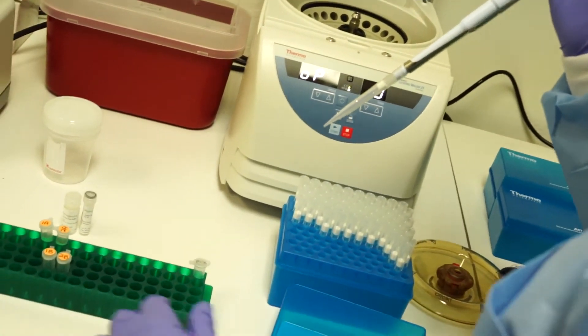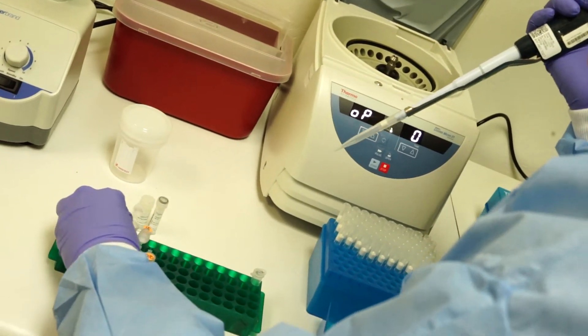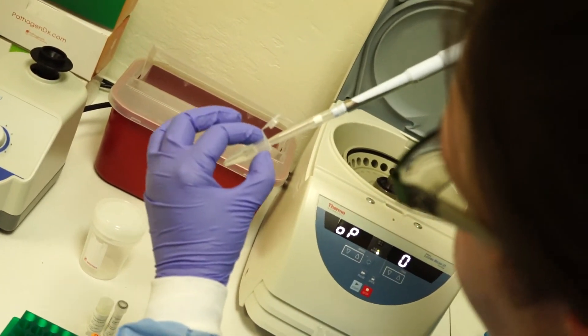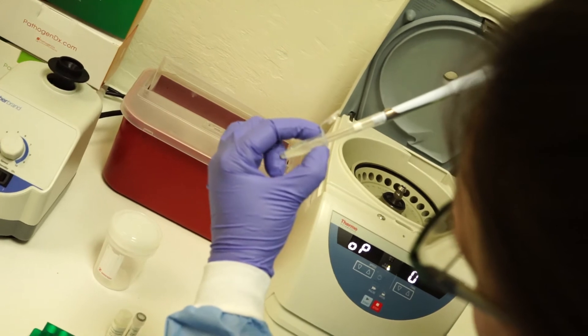Set your pipetter to 1 ml and carefully transfer the supernatant. Avoid the pellet or plant debris shown at the bottom.